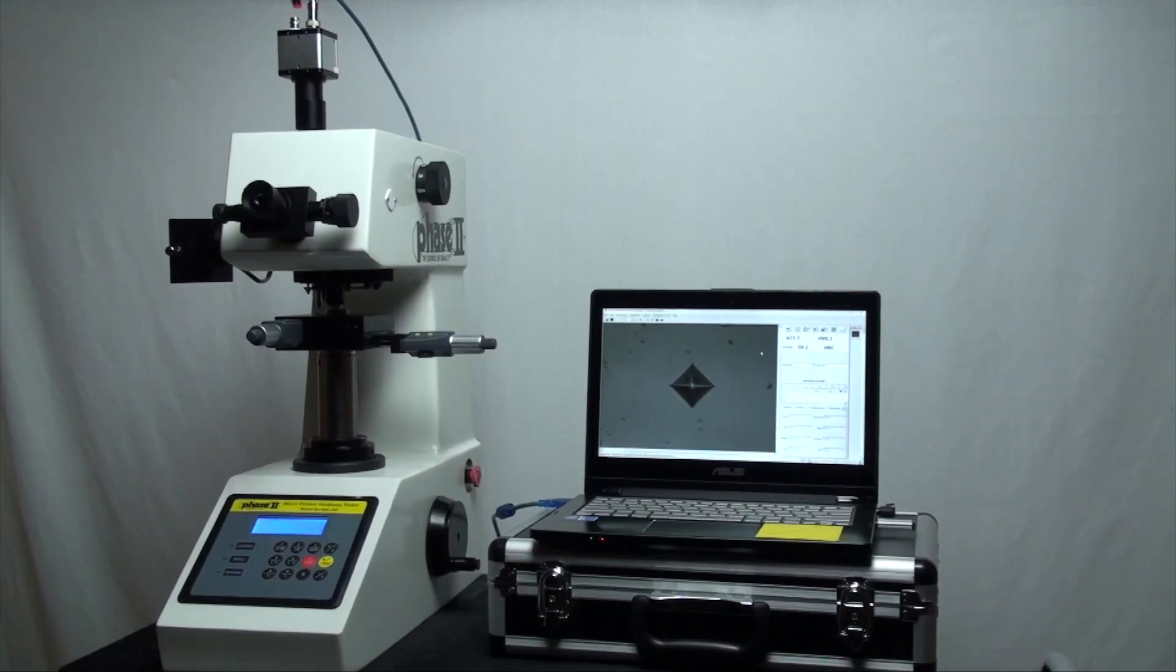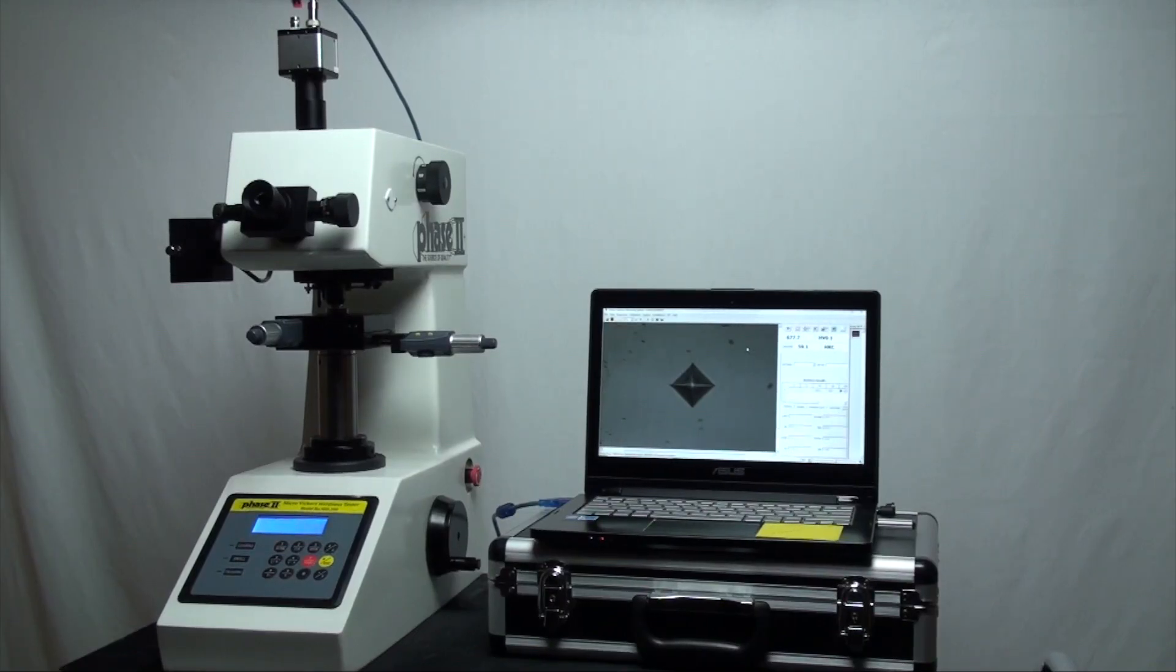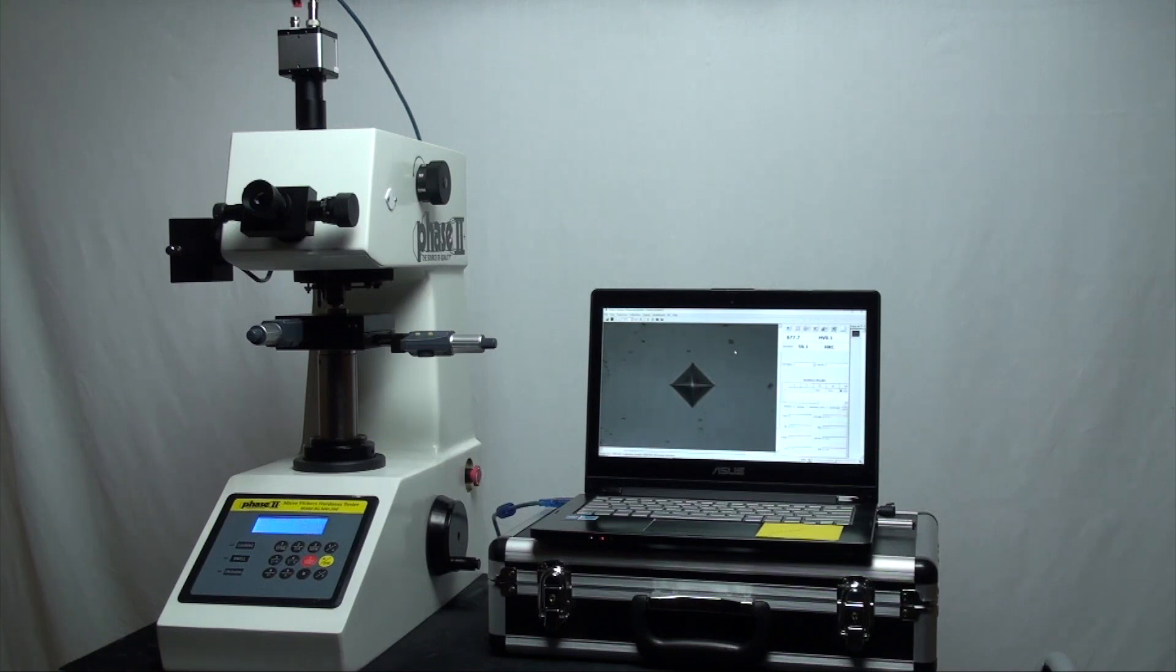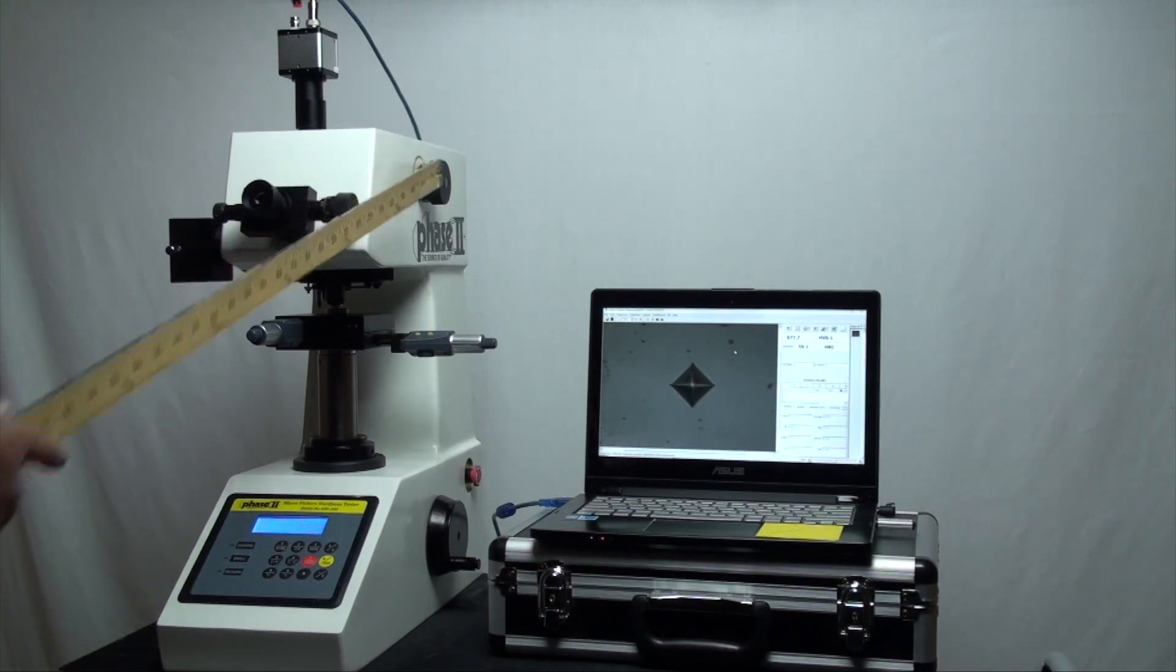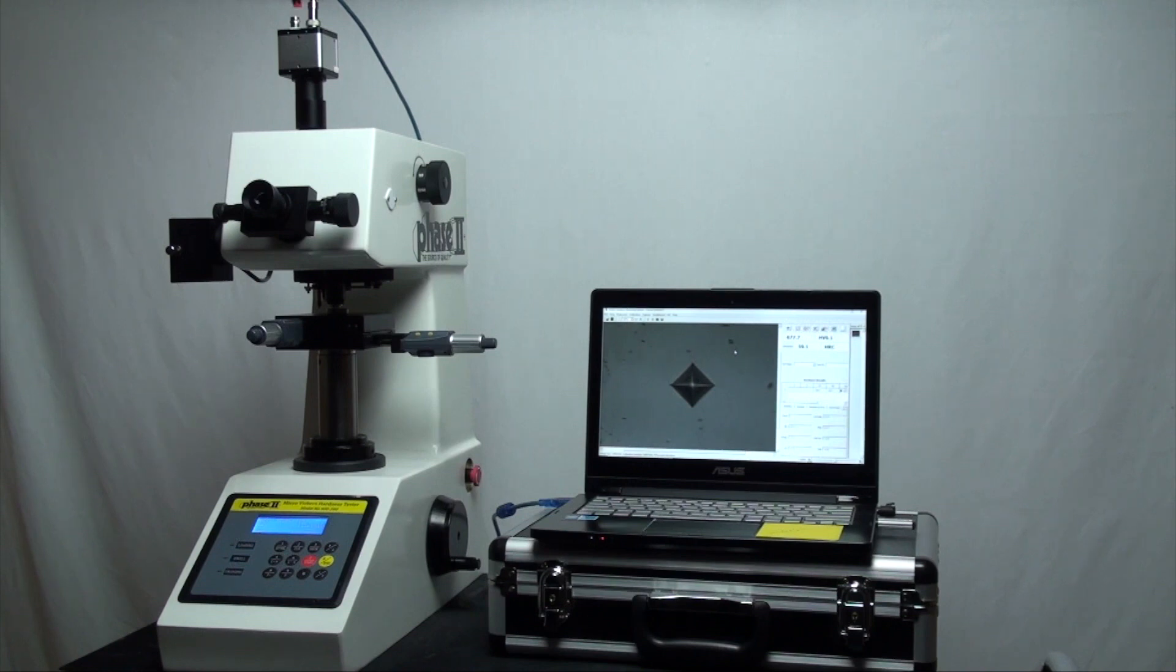Let's begin with the unique design of this series hardness tester. Here we have the weight load selector, the manual optic system with left and right measuring drum wheels.